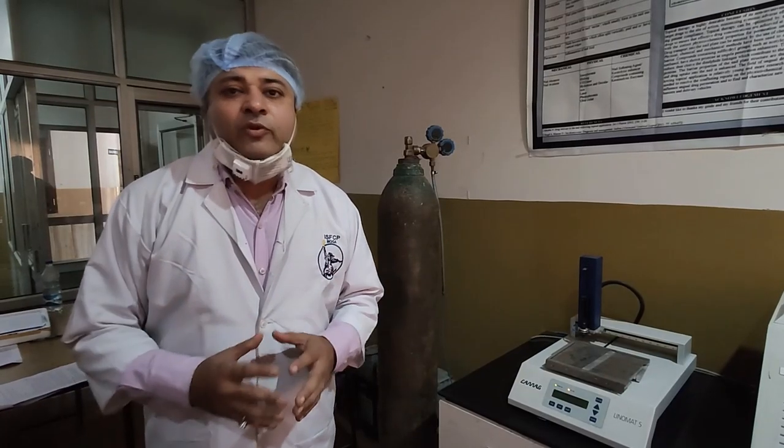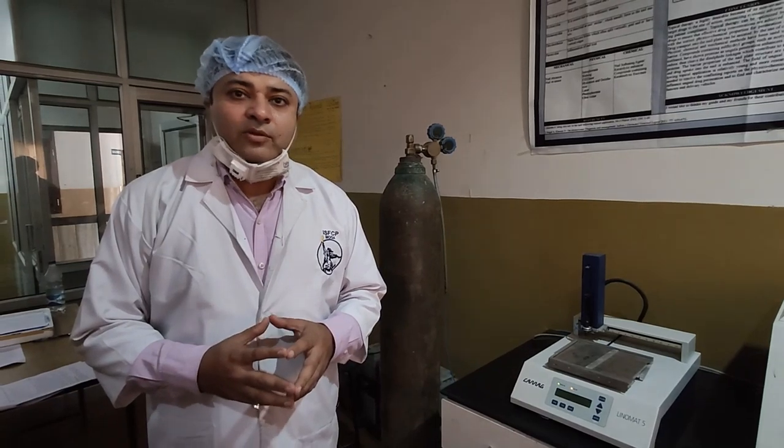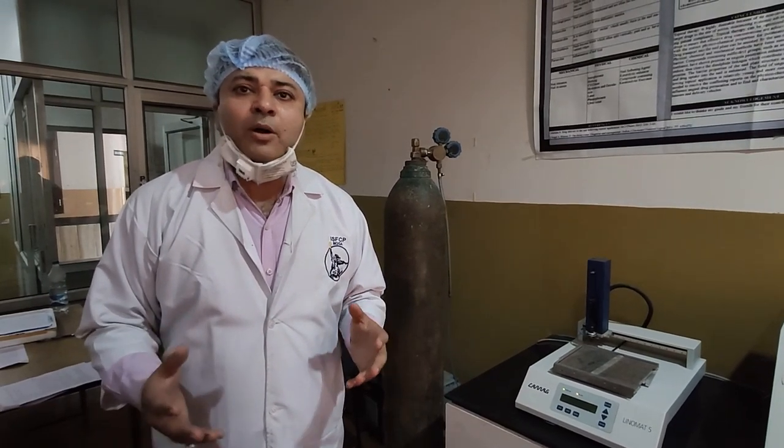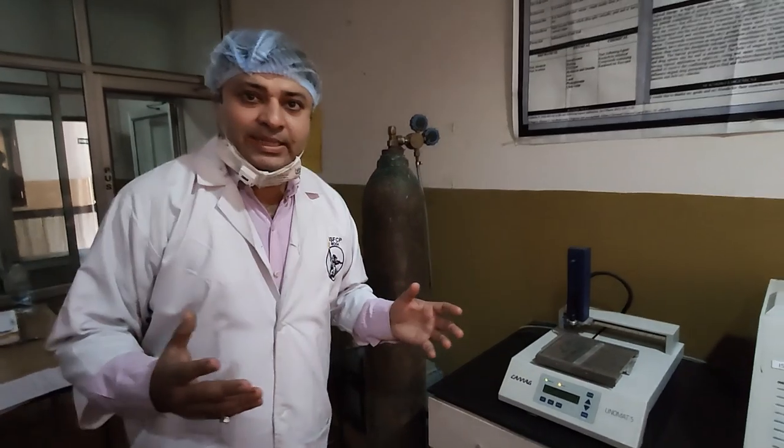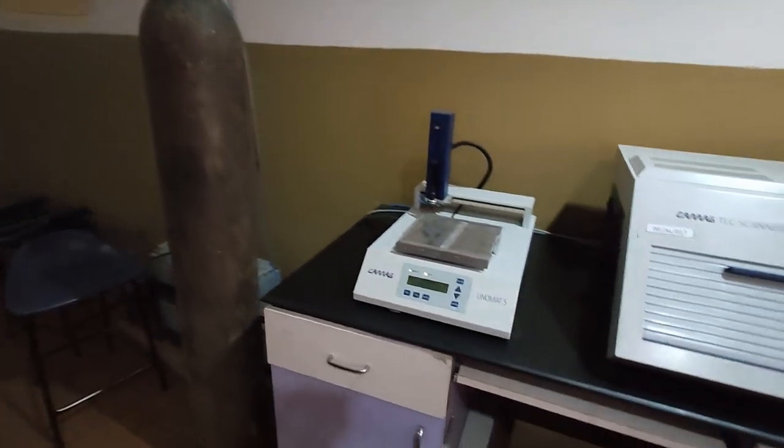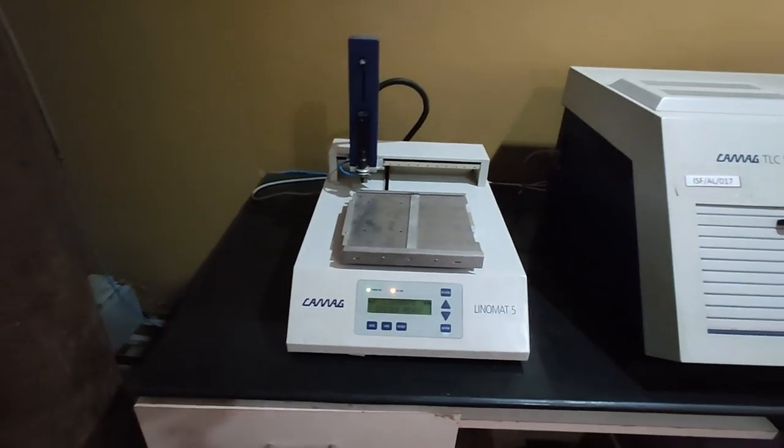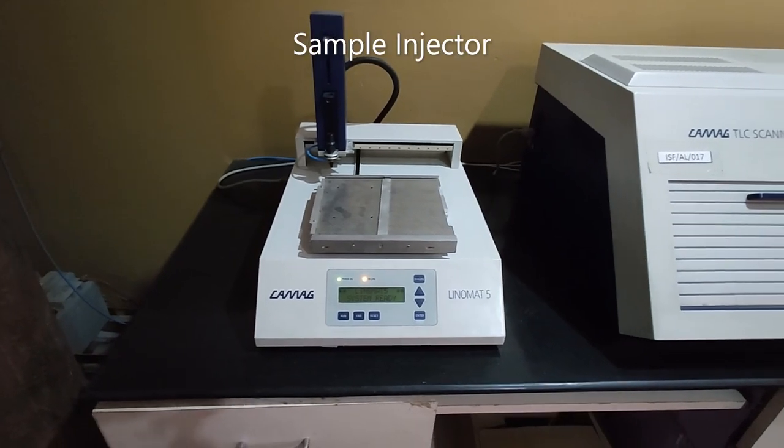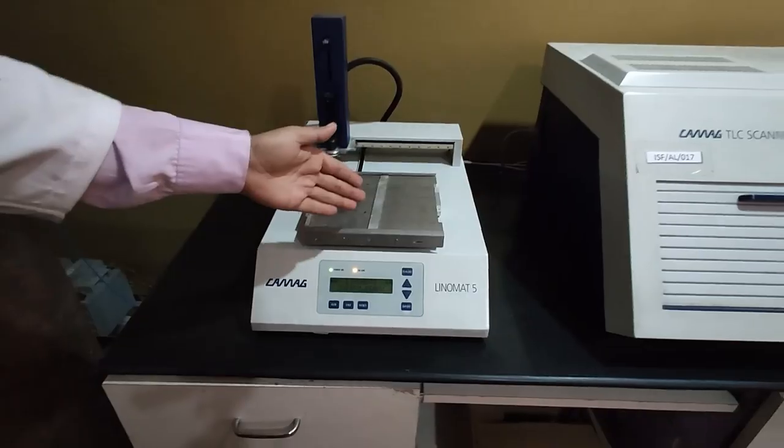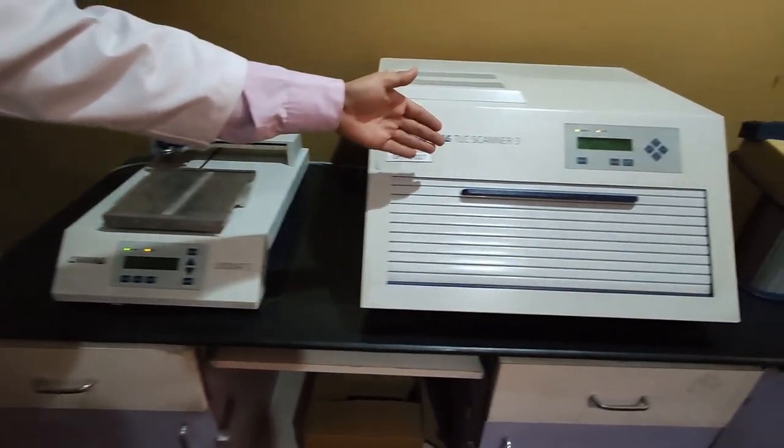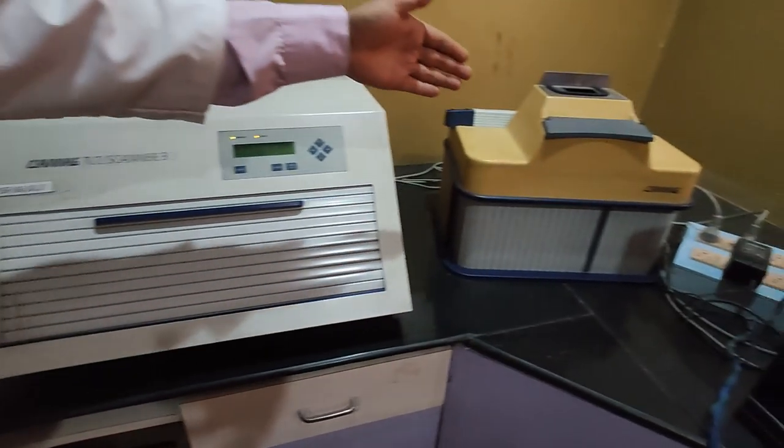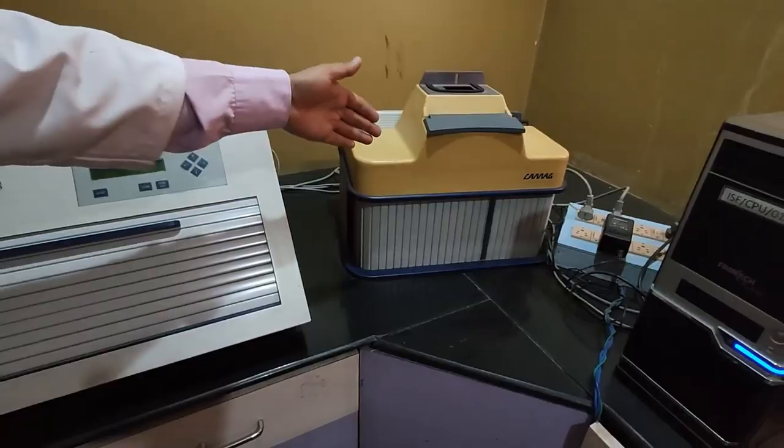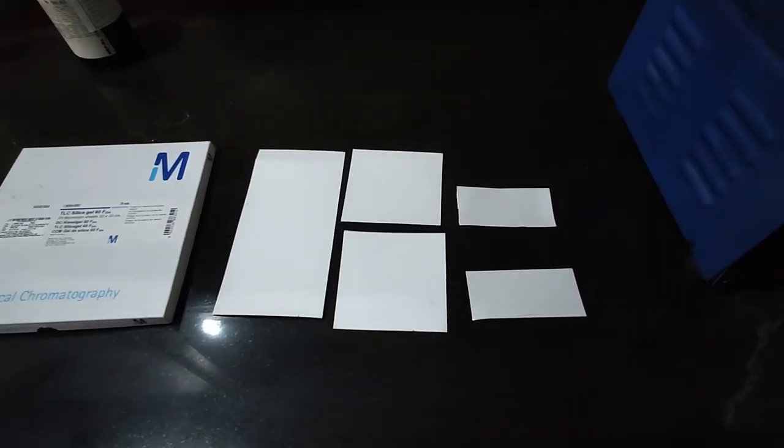Before we start the training session, first of all, we should know about the instrument. Basically, this instrument has three parts. The first part is sample injector, another part is TLC scanner, and the third part is visualizer.